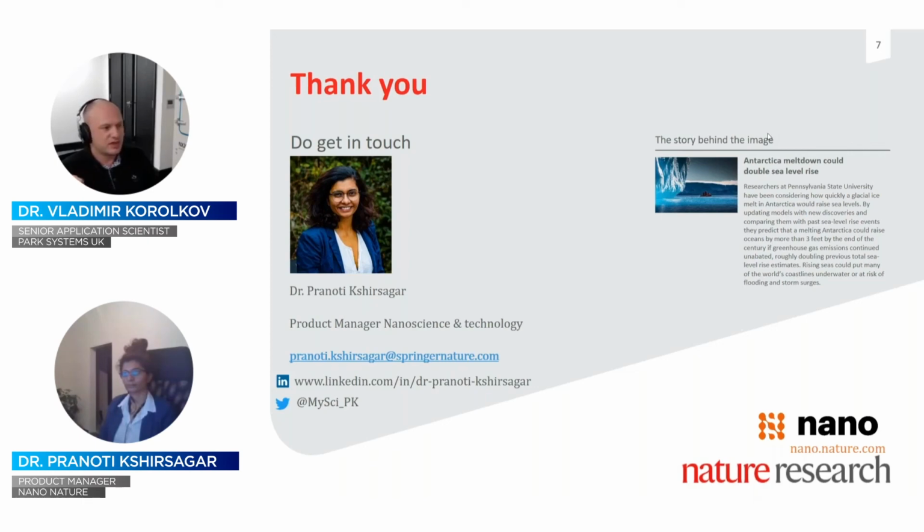From whatever manufacturer you may use, there are no particular numbers or range of numbers that you may use. That will very much depend on the instrument, your sample, scan size, and scan speed, how quickly you scan, and that will determine those gain parameters. So sorry, I can't be more specific, really. It kind of gives you the direction where to go.